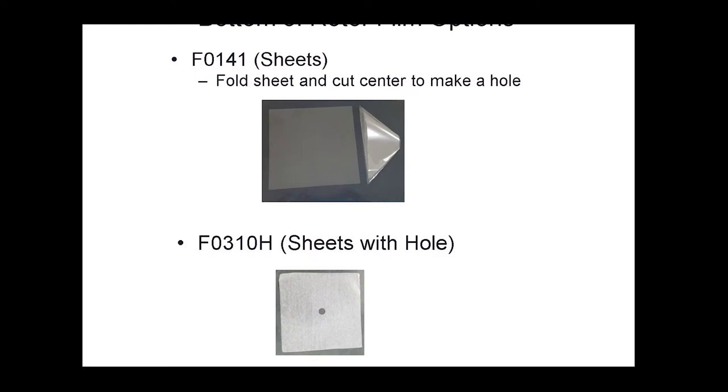The film used for a single sheet is the F0141, which comes in pre-cut sheets and is placed on top of the sample before closing the dies to simplify sample removal. For two sheets — one on top, one on the bottom — the bottom sheet must have a hole for the shaft. One option is to fold the F0141 sheet and cut the corner to create a center hole. An alternative is the F0310H film, which already comes with a pre-cut hole in the center.